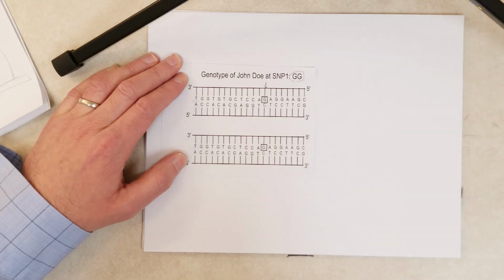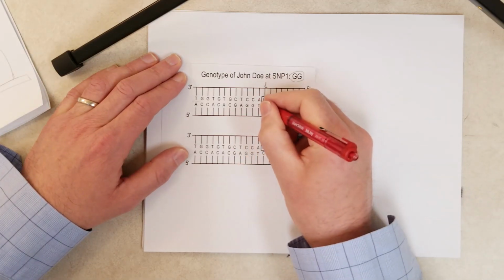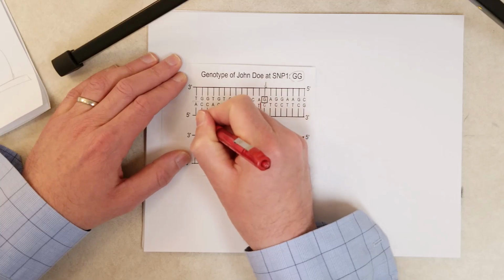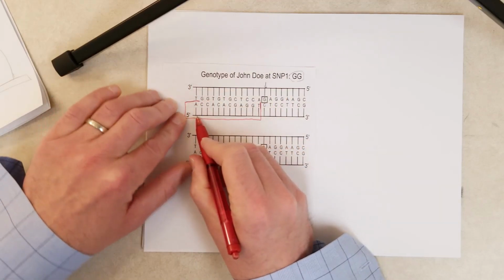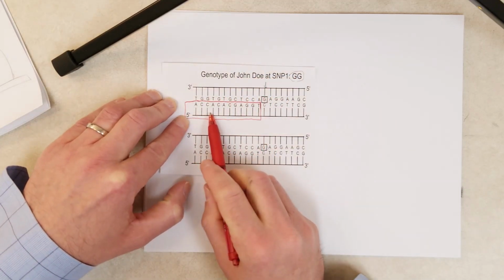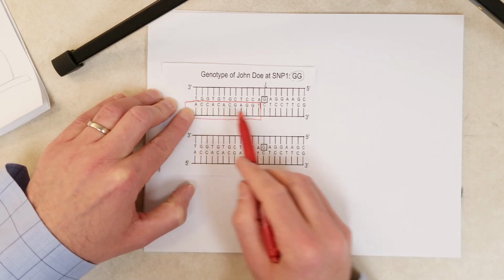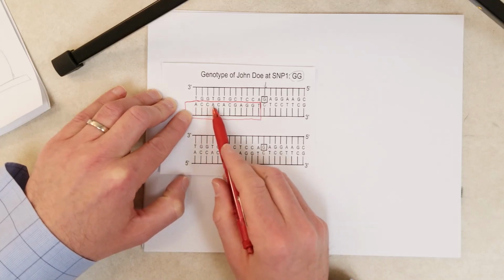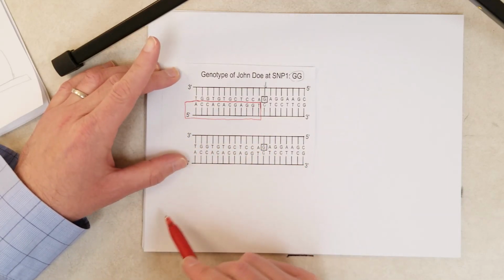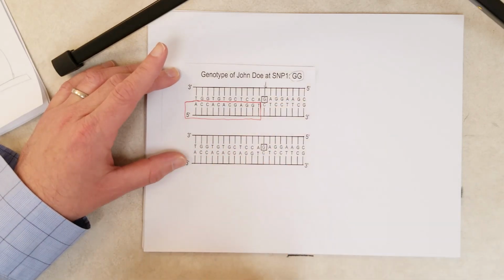So how does the genotyping process work? Well, the sequence of the SDO is going to be right here. I'm going to draw a box around it. Remember the SDO is single-stranded? So essentially it's going to be identical to this single strand right here. So ACC, ACAC, GA, GGT. It'll start with an A, ends with a T. If it was only, 1, 2, 3, 4, 5, 6, 7, 8, 9, 10, 11, 12 nucleotides long, it's probably going to be longer than that, right? But for this example, let's assume it's only 12 nucleotides long. It's going to end right here at that T.